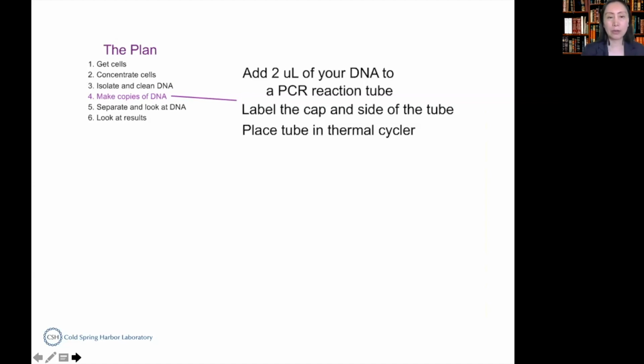do this. Okay, I'm now going to show you how to do it with your hand. Now I'm going to show you how to do the PCR step. To do the PCR, we need a primer mix here. We need 23 microliters of that.